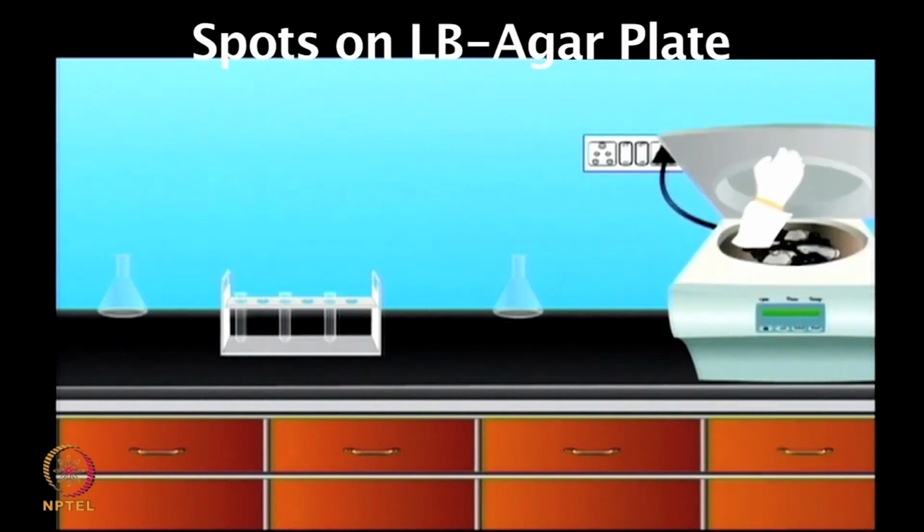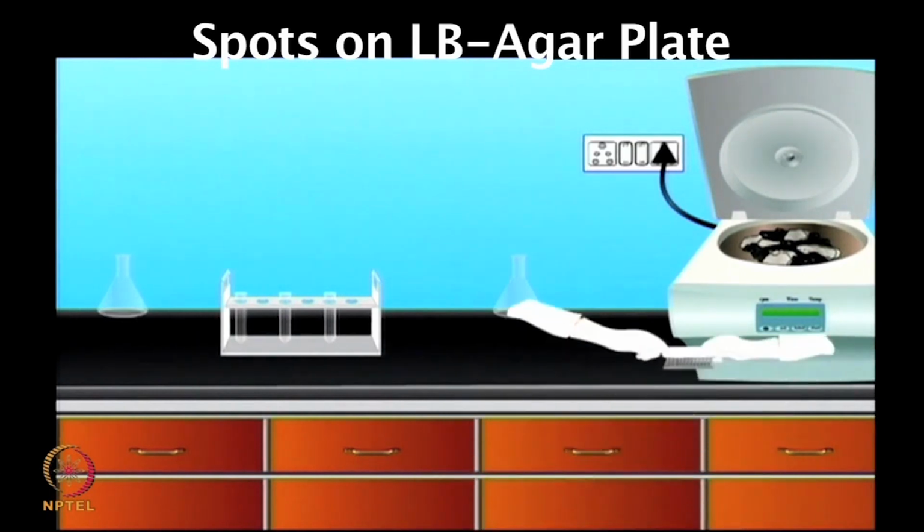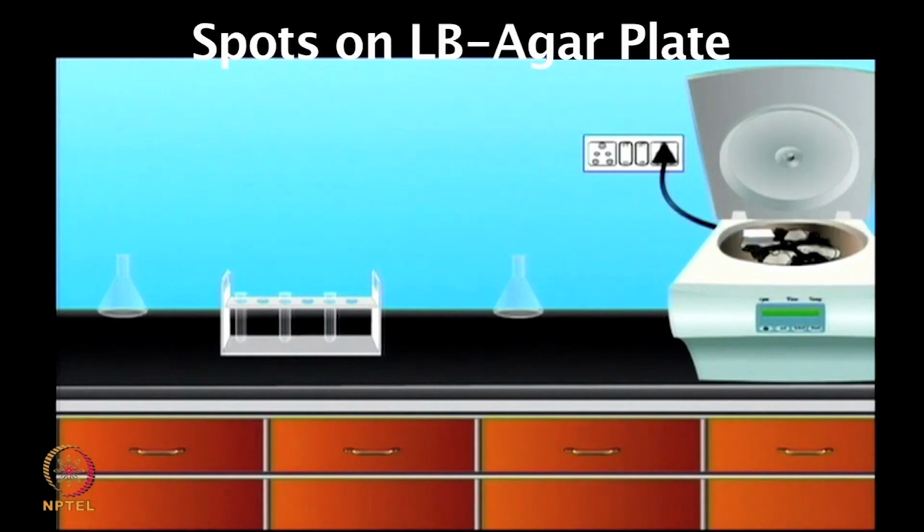You can centrifuge these blocks for 15 minutes at 2000 to 2500 rpm. While doing centrifugation, ensure that the centrifuge is balanced.